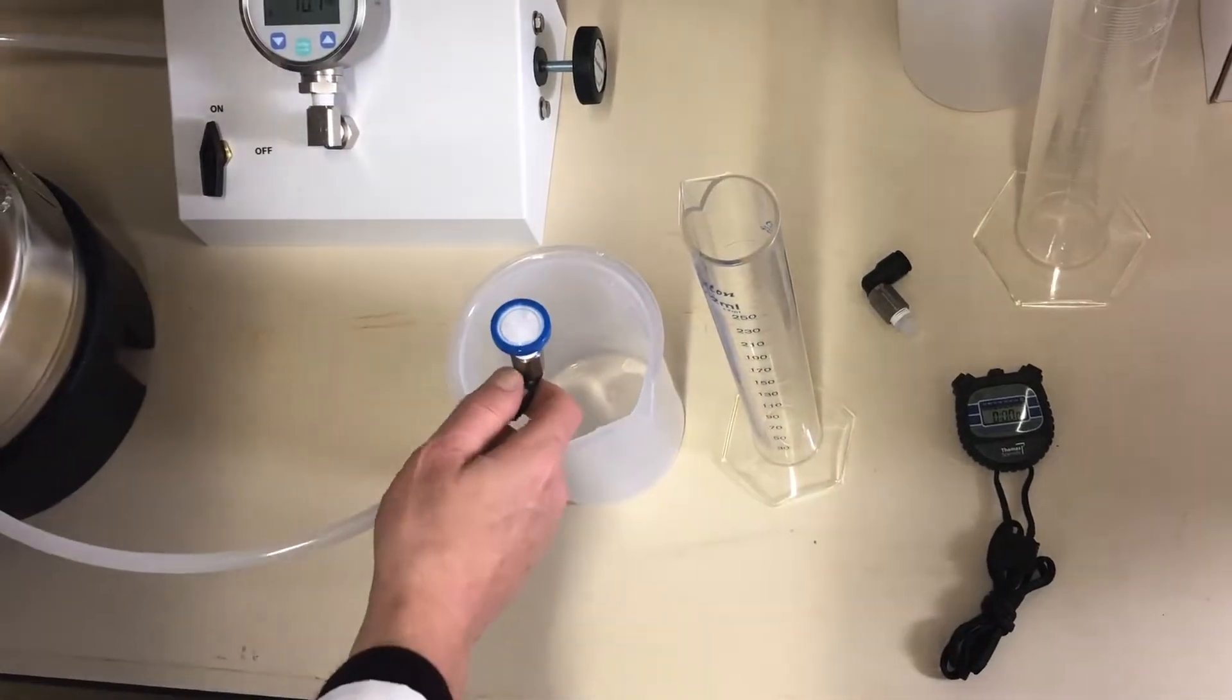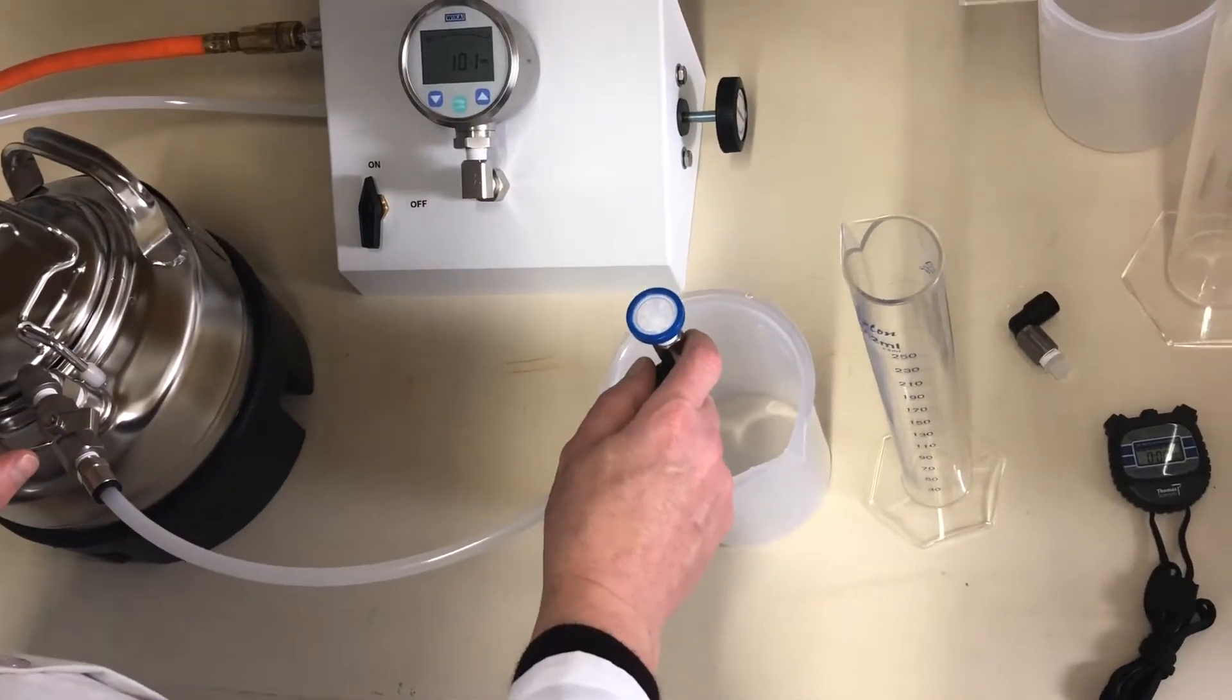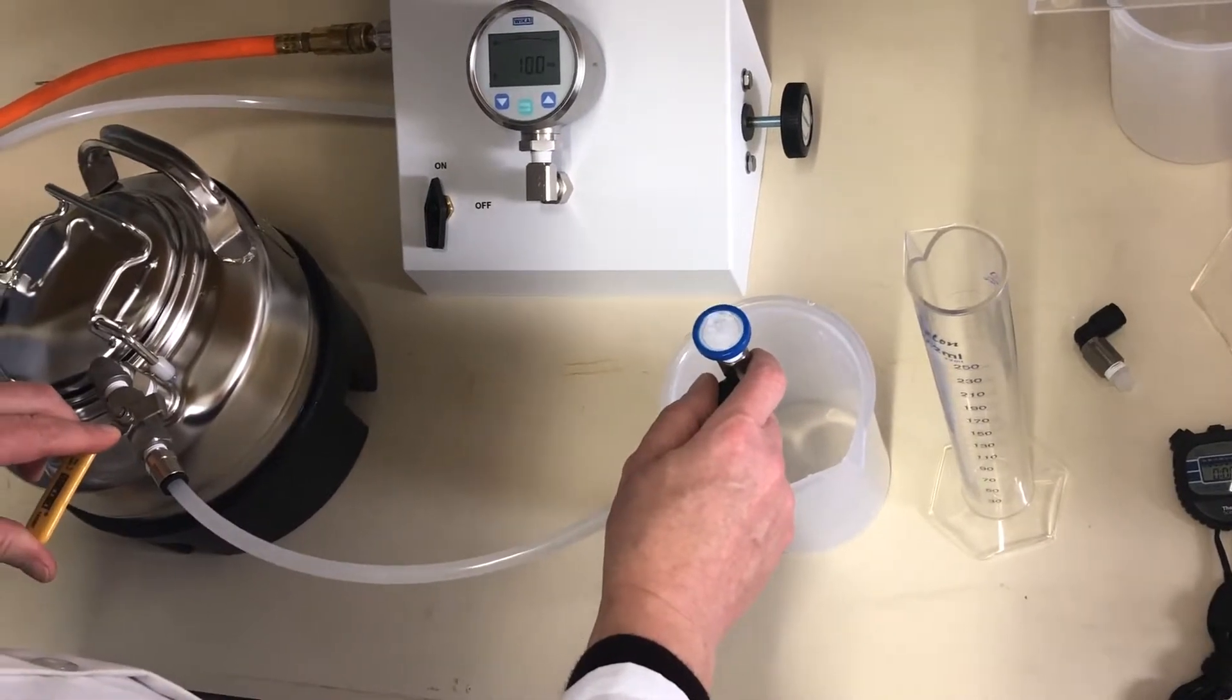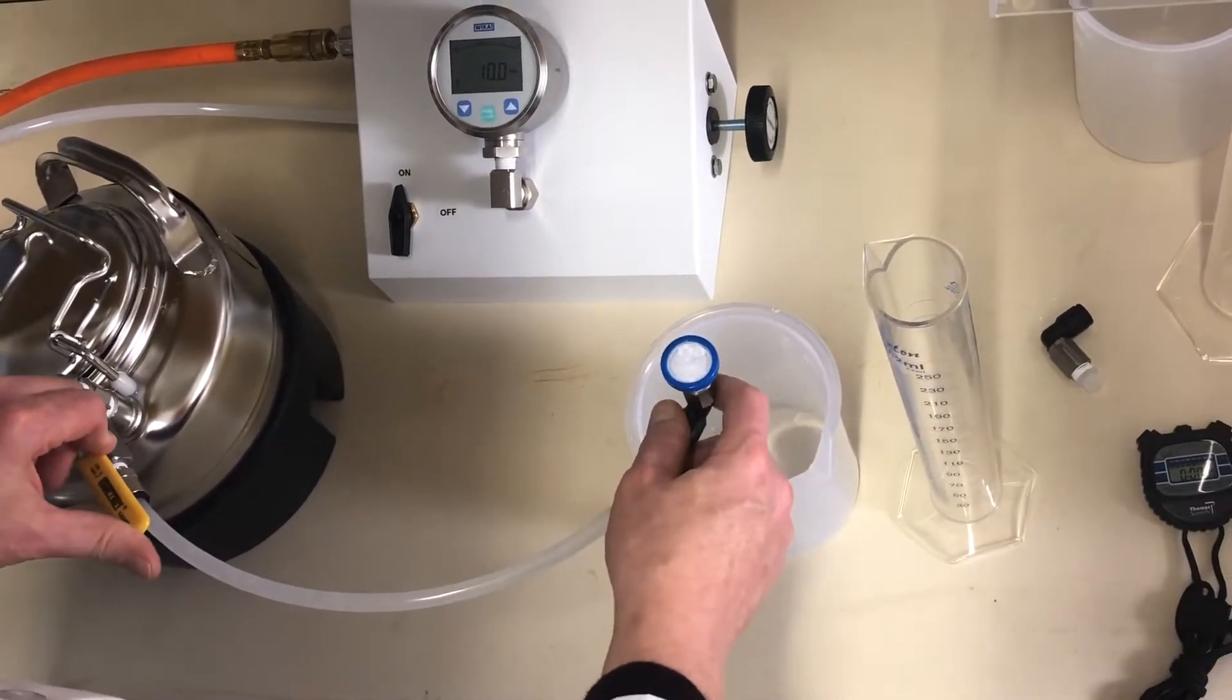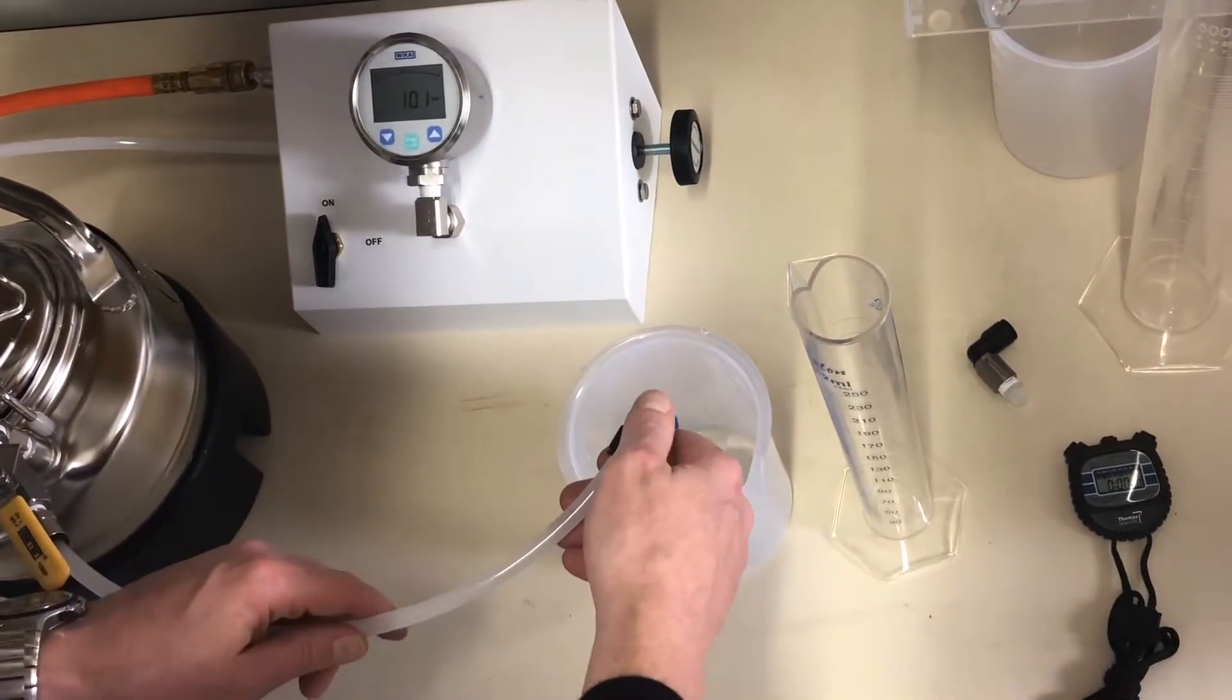Then we'll open the water while the filter outlet is facing up to make sure that we don't trap any air in the line. And once flow is established, we'll turn the filter over, and I think I still airlocked it.